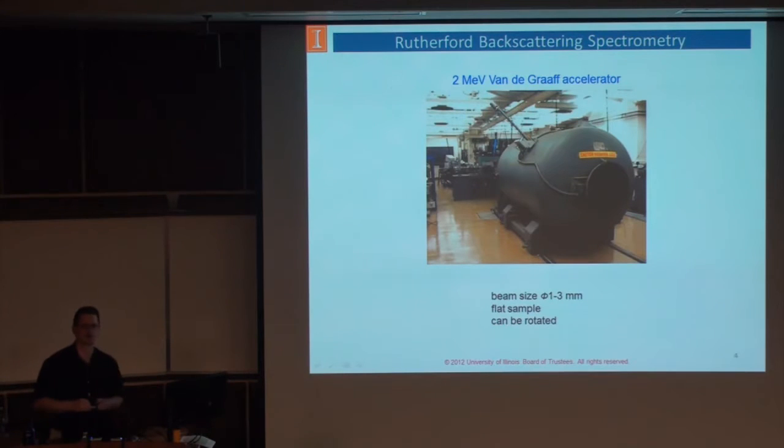This is the Van de Graaff accelerator. If you're wondering what that is, remember back to the guys at the science fairs where they have the accelerator there, you put your hand on it and your hair stands up. Same thing, except here we're going to much higher voltages, so we actually put it inside a pressure vessel, which is at about 7 atmospheres, to keep breakdowns from happening.